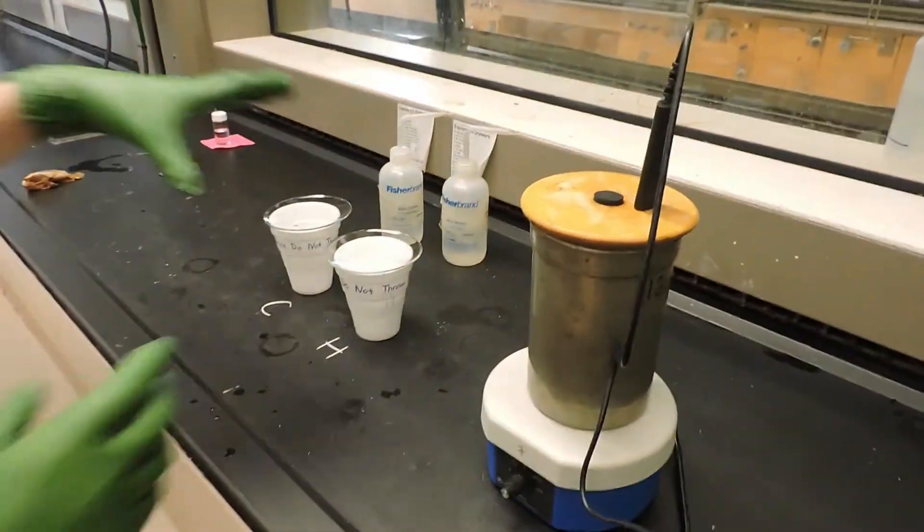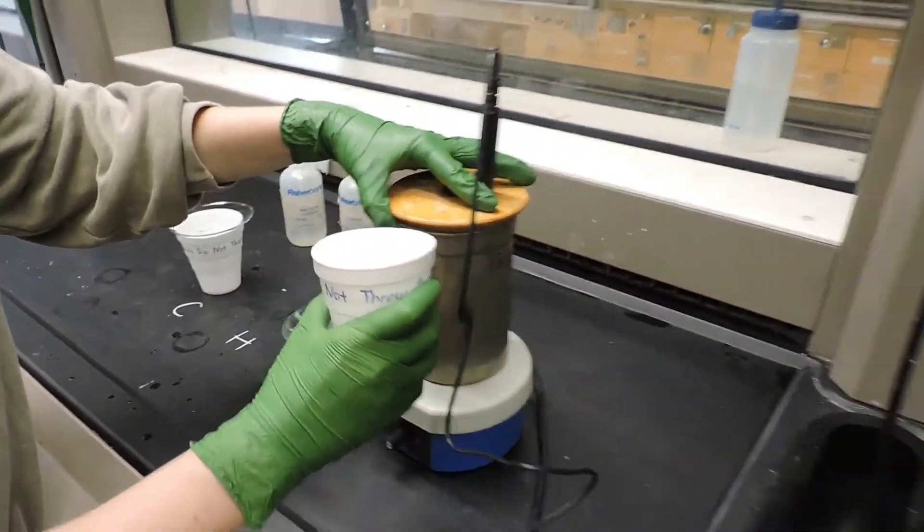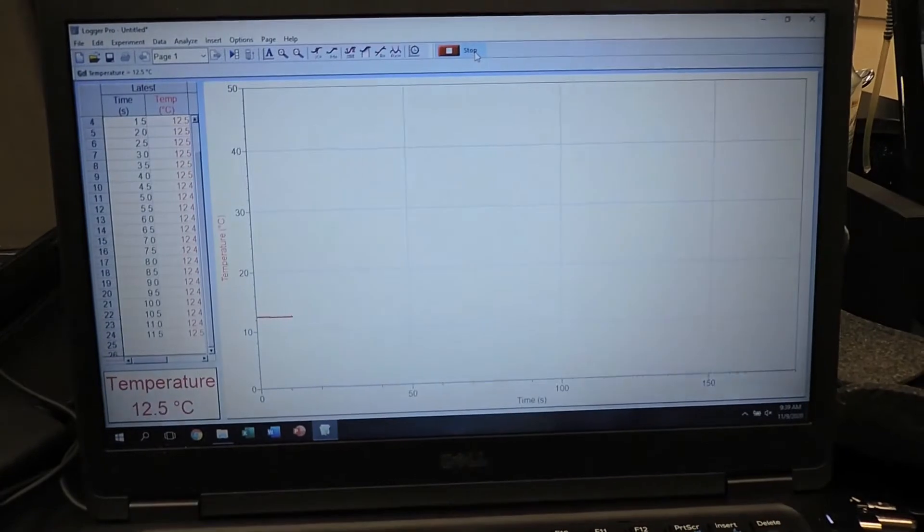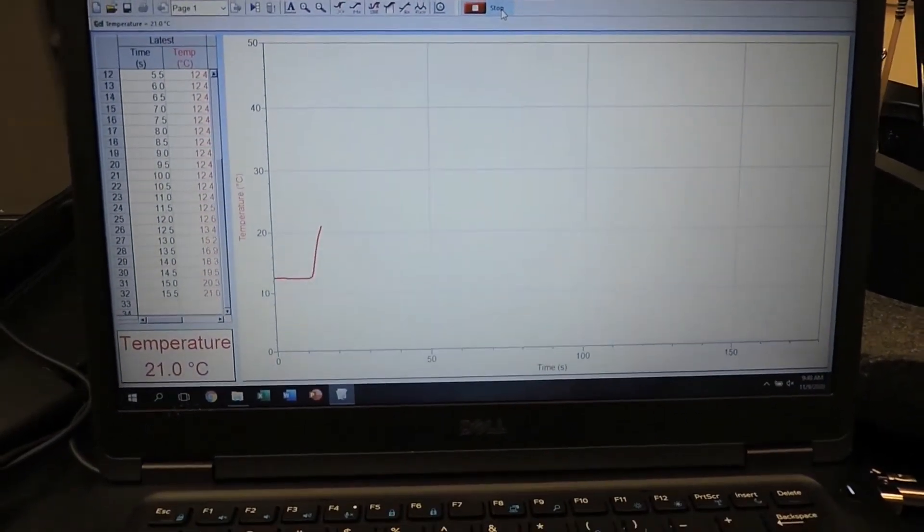We'll crack the lid of the calorimeter slightly to introduce the hot water. Here you can see we are collecting, and with the introduction of the hot water, you immediately see a spike in the graph.